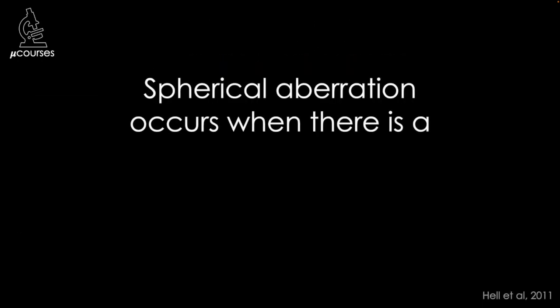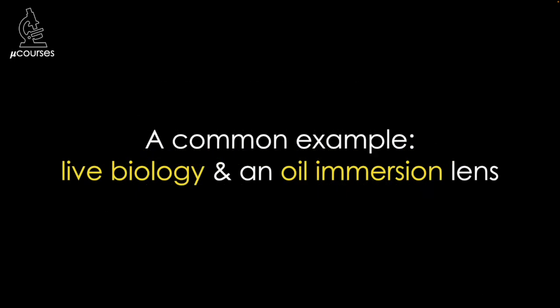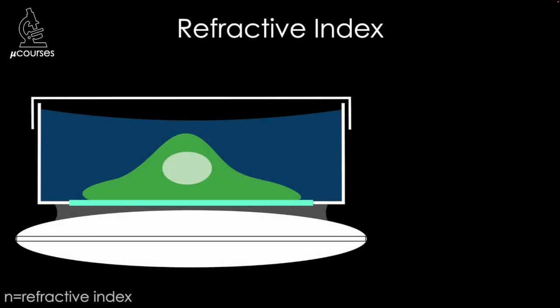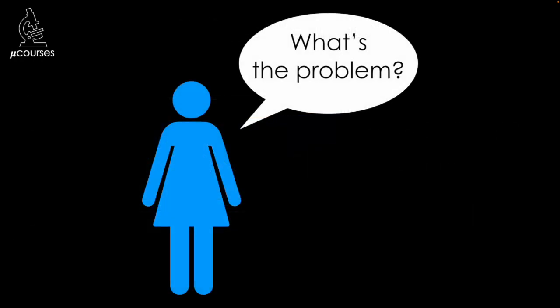Spherical aberration occurs when there is a mismatch in refractive index between the specimen and the lens immersion media. For example, in the very common scenario of imaging live biological samples with an oil immersion lens, the immersion oil refractive index is matched to the refractive index of the coverslip, but the specimen has a different — often lower — refractive index. This is not meant to discourage you from using an oil immersion lens; high numerical aperture oil immersion lenses are often the best choice. However, even the best choices in life come with limitations and compromises.